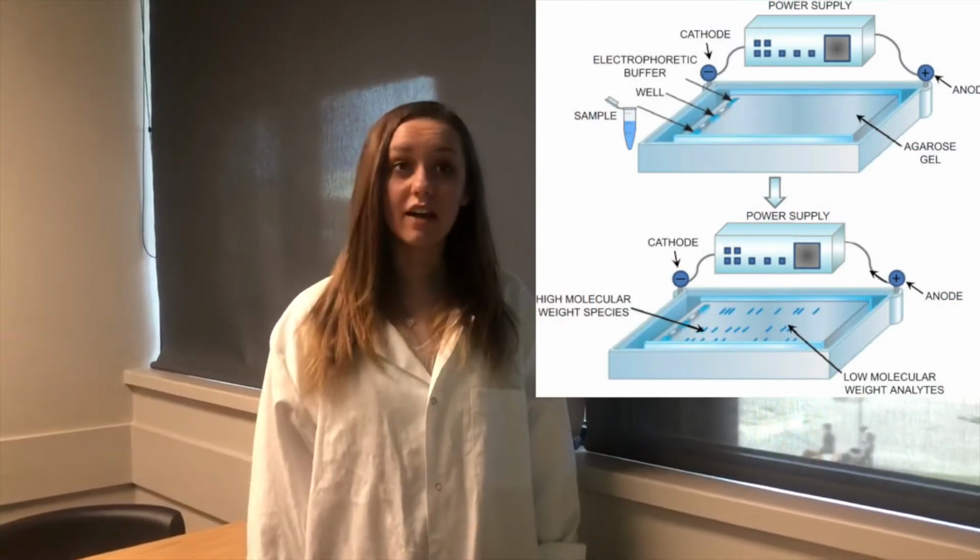Electrophoresis is a common method for mapping the restriction fragments of DNA or RNA. Fragments are inserted into the gel at the cathode end with an electrical current applied through the gel, which attracts DNA to the anode, because DNA is negatively charged. A buffer solution is poured over the gel to allow the ions in the solution to carry the charge of the current, which moves the DNA along in the gel.